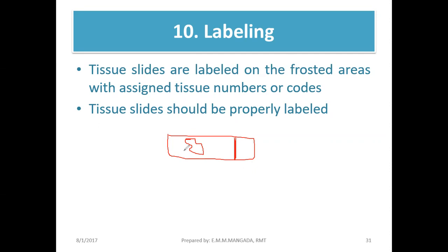for example, if this is a tissue coming from the buccal cavity, you can just say epithelium, buccal mucosa. So ano yung specimen mo na yan? That's for histology. But for histopath later, iba yun. Sa ospital, iba yung labeling na ginagawa nila.